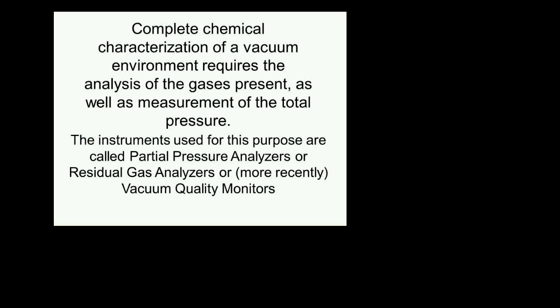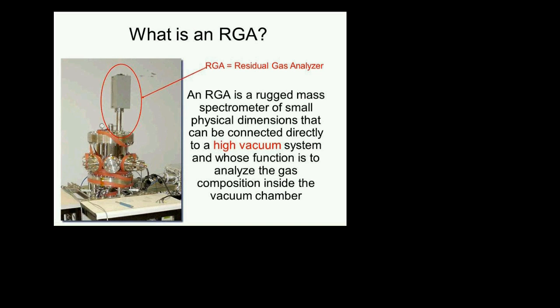The good news, though, is that in terms of spectral interpretation, in terms of data analysis, in terms of software configuration, both devices work exactly the same way. So what is an RGA? What is a residual gas analyzer?